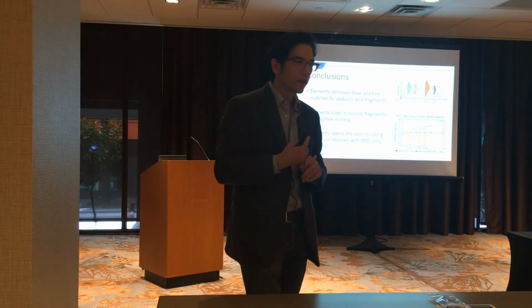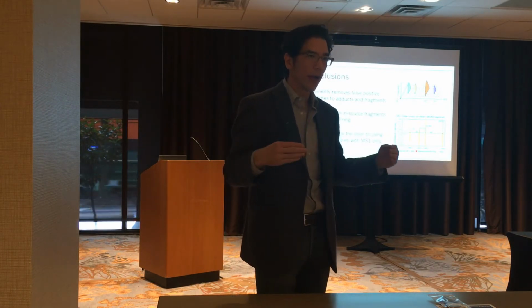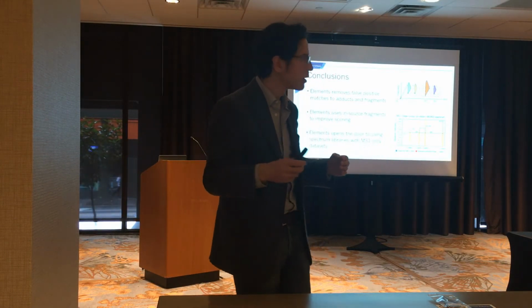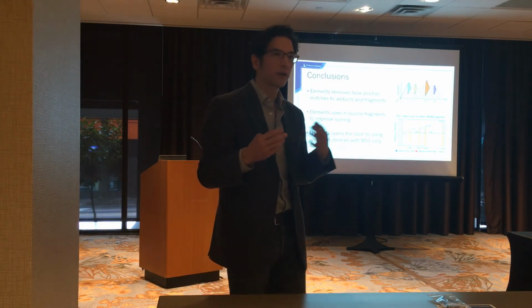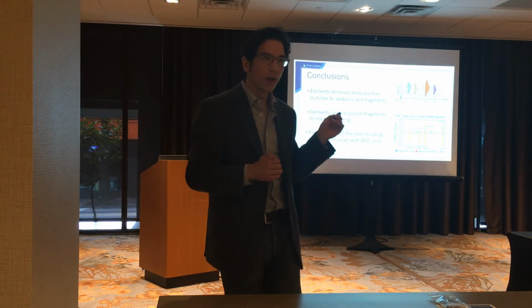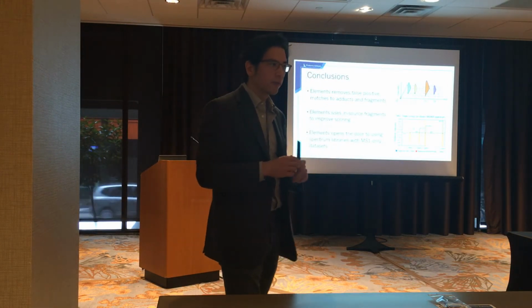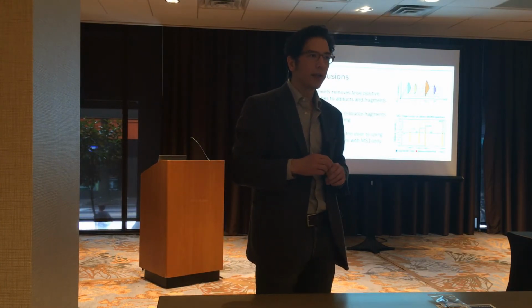It also removes a lot of the false positives, frankly, that are caused by these co-eluting adducts or co-eluting in-source fragments. And so as a result, we're feeling like our detection rates are actually going up substantially from this. One of the things that's been sort of shocking to us is that this might actually breathe new light into these MS1 only data sets.